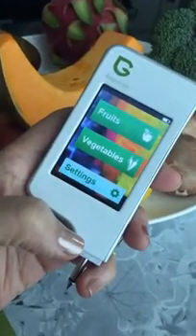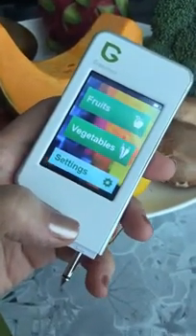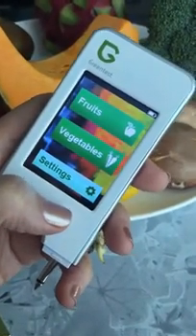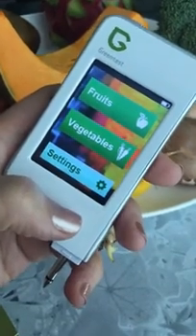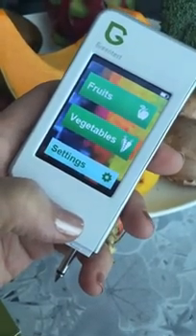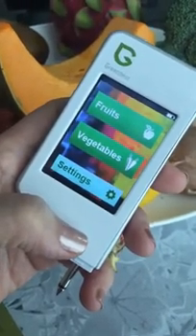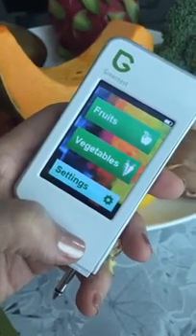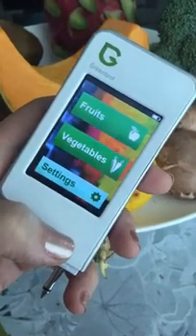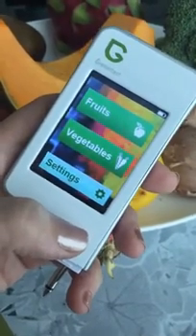In my continuing quest to eat as clean as possible, I chanced upon this gadget I bought off Amazon recently. It's called the Green Test, and apparently it's designed to test the level of nitrates in our fruit and vegetables. The device has predetermined safe levels of nitrates. We all know nitrates are bad news — in food production they're used to preserve food, and they get into fruit and vegetables through the soil as well.